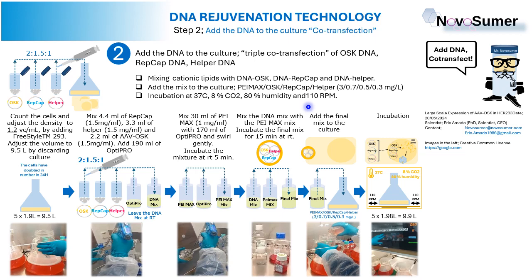Okay, so let's go for the first step in here. Let's read with me. We have our culture that grew the last day. So we have it here, nice, the smell is good, the color is good, and we count the cells.